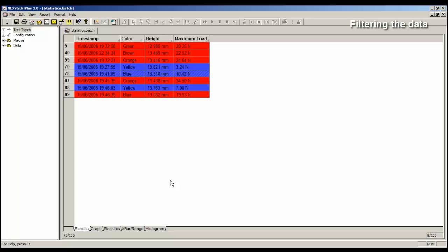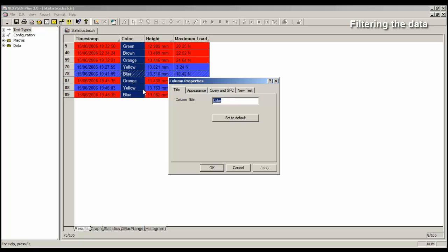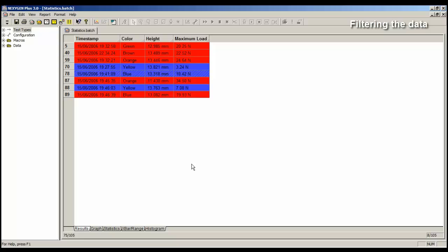So to do this, we need to select the column that we want to filter. We need to filter on the colour column. So right mouse click and in the menu select Properties, then select Query and SPC and now we're going to check the option Include this column in row queries. When I click on the OK button, that is now part of the filter.